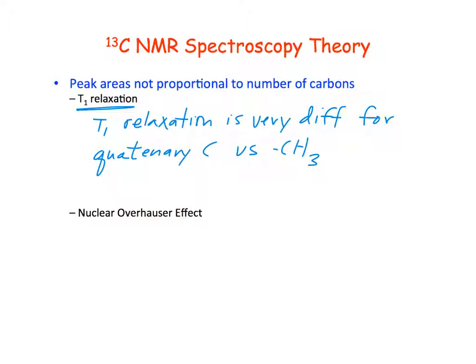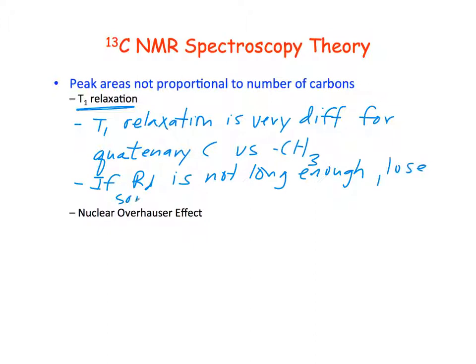All right, so if this relaxation delay is not long enough, we're going to lose some signal intensity.